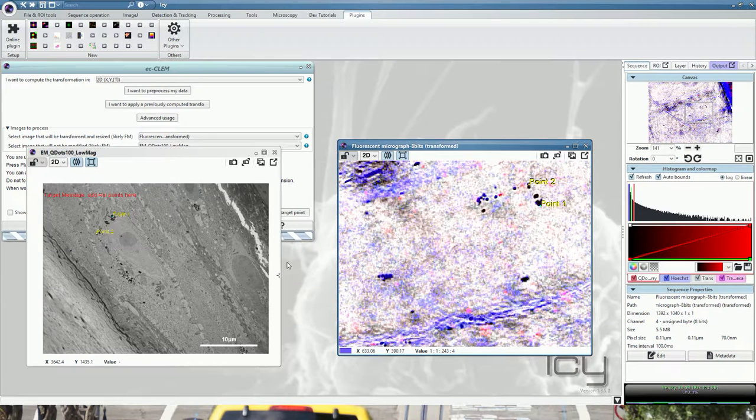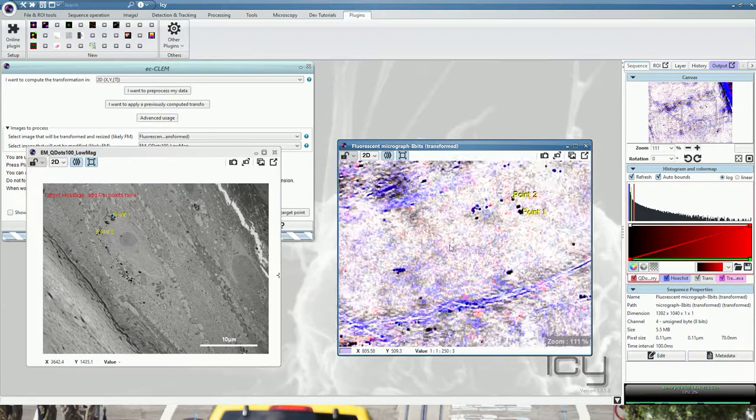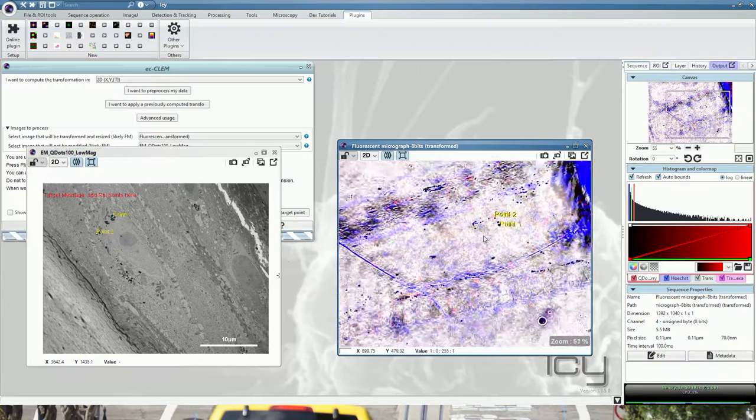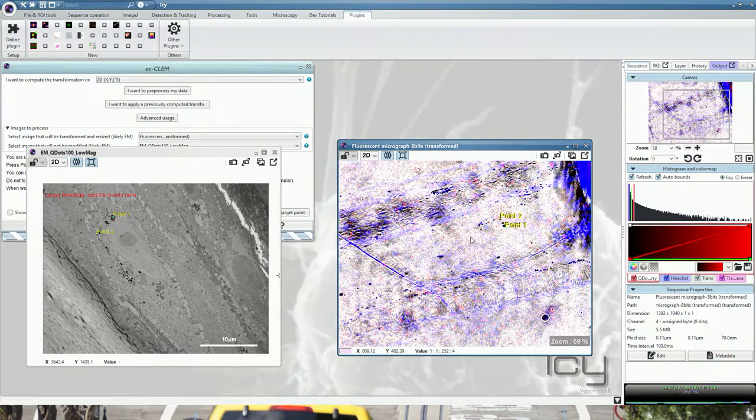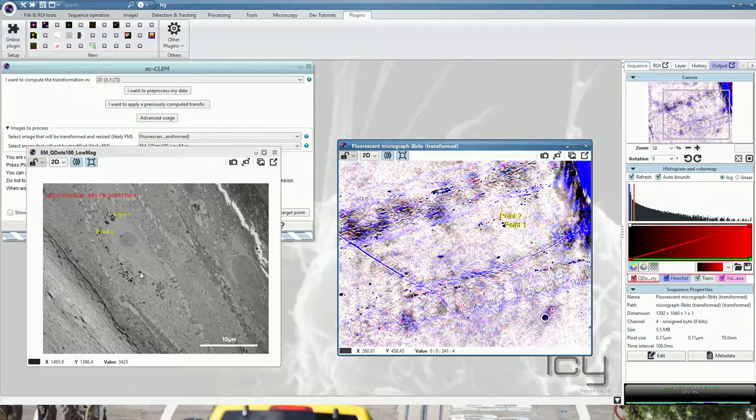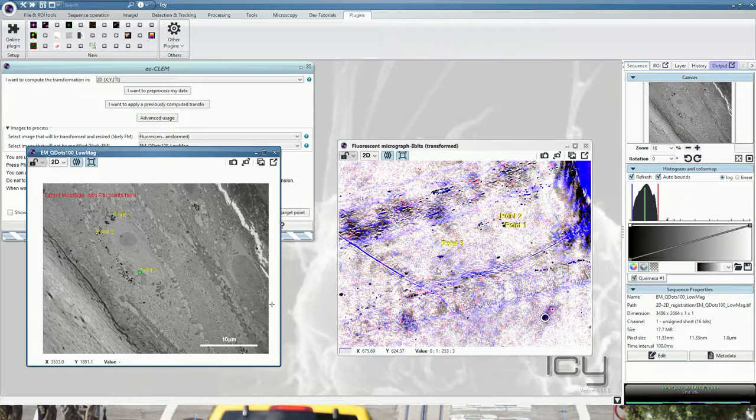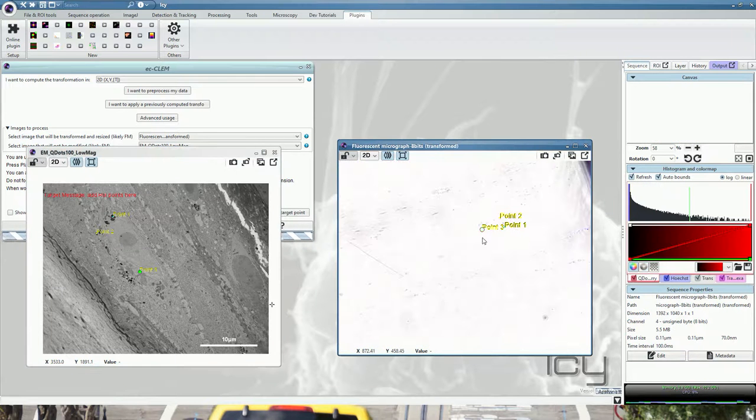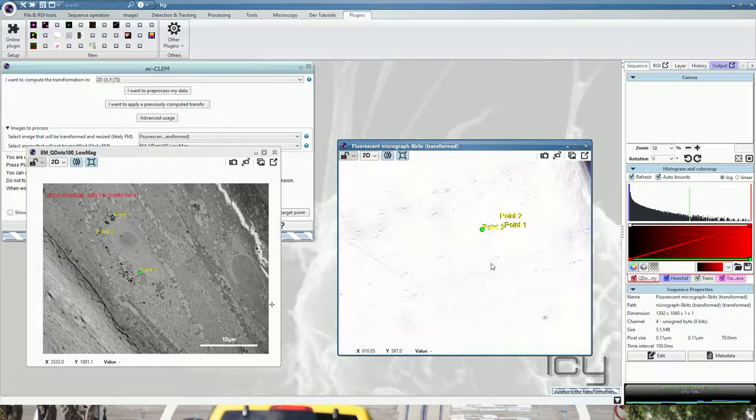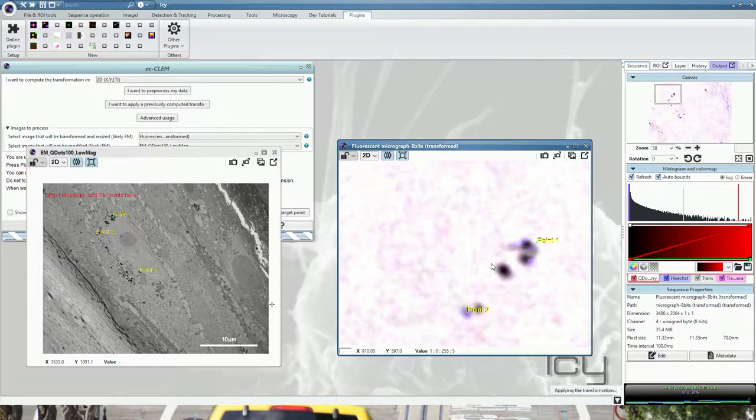This is simply because the transformation is not calculated and the software has no a priori knowledge of the transformation. Place a point here, drag and drop it. Now that we have enough points, it will calculate the first transformation.